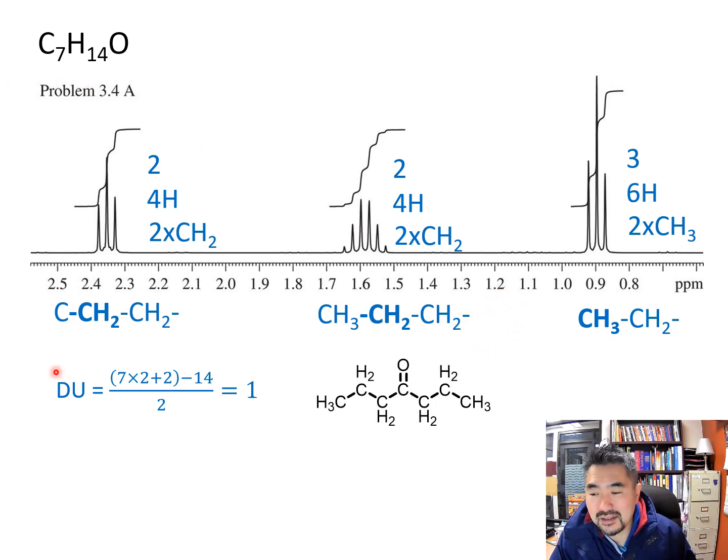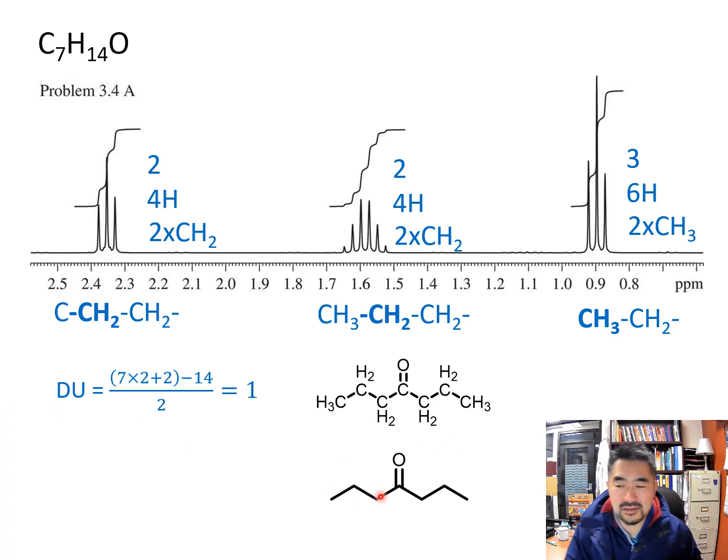And it must be a symmetrical thing to account for the 14 hydrogens like this. To draw the structure more nicely, it's this molecule here, which satisfies that chemical formula. So we figured out the structure. Hopefully that makes sense to you, and please practice with the rest of the dry lab packet. And hopefully you won't have too much trouble with this because this should all be reviewed from OChem. So anyway, if you have questions, let me know, and I shall see you in person very soon.